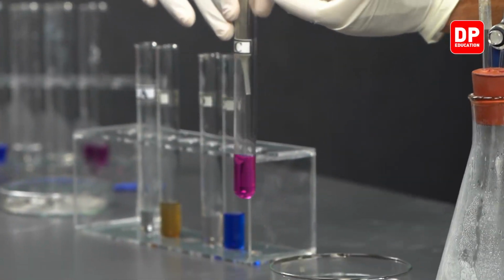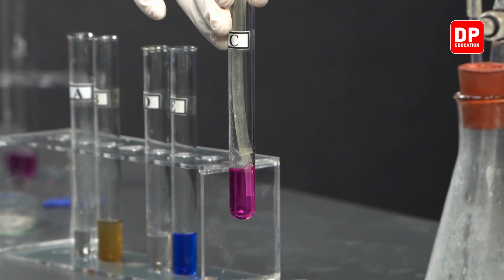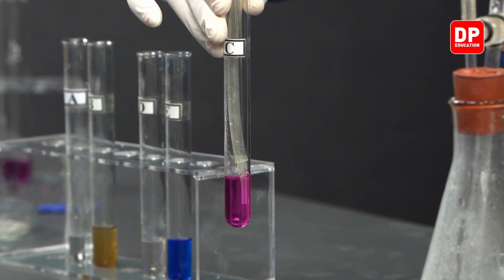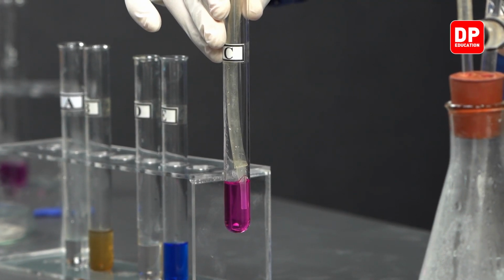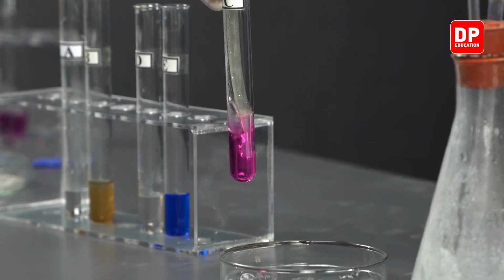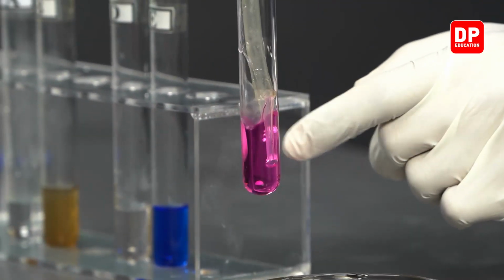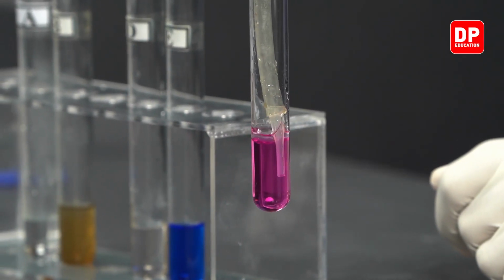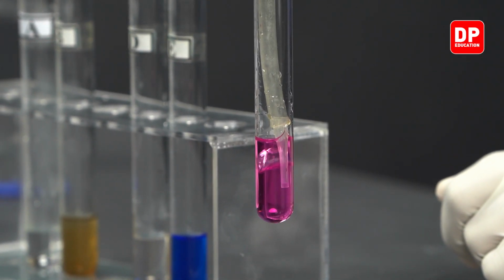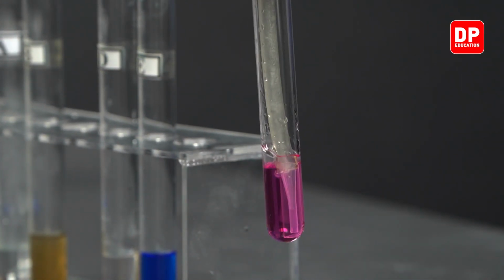And then let's insert this tube and observe what type of color change is going to be seen when the acetylene gas reacts with acidified potassium permanganate. What type of reaction takes place can be observed here.